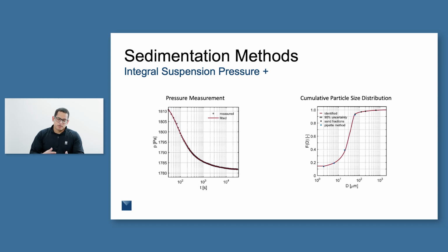And so as our soils become more complex and we see a little more complex curves, this gives us more information on what that soil actually looks like and what that might mean in terms of how the soil is going to behave for some of the different processes that we're going to be trying to understand.